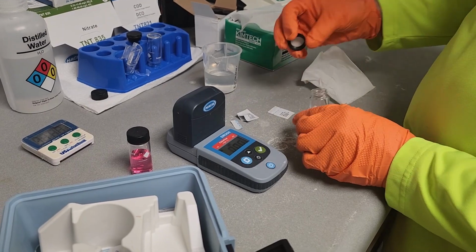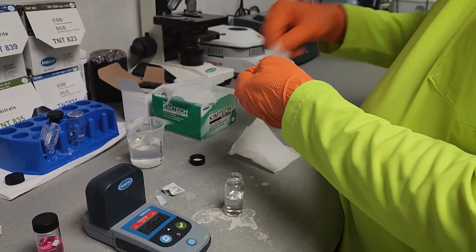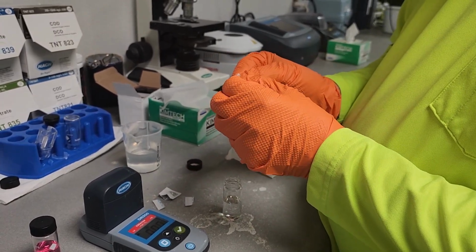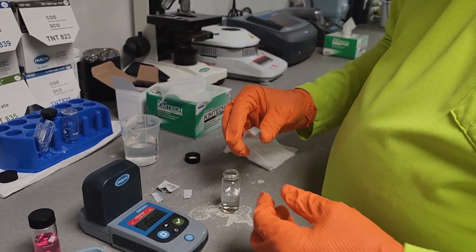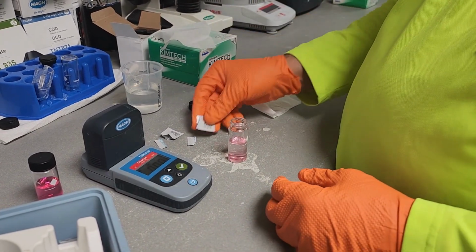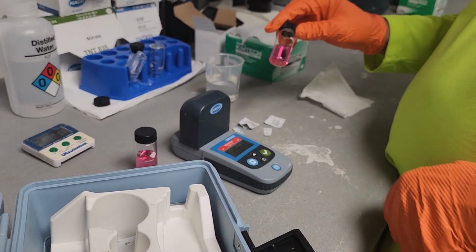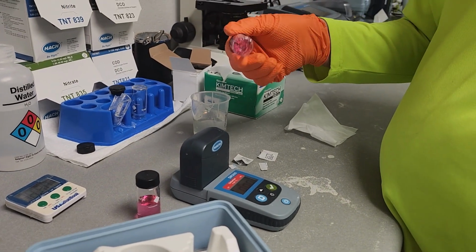Now, this is a total chlorine DPD, and we're going to let this one cook for about 3 minutes. Those are the instructions from the manufacturer. We're going to follow their procedure. Boy, we saw a reaction right away, didn't we? Yes, sir. Start. There we go. We're going to give that 3 minutes to cook, to react.